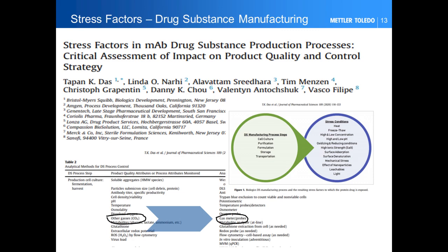So past 40 years, many publications are mentioning the benefits for tracking the dissolved CO2 content in culture media and as a stress factor that would impact downstream operations. So it's interesting beyond the impact on pH alone to look at dissolved CO2 with different perspectives, essentially a stress factor, so impacting directly productivity, batch to batch, and quality attributes.